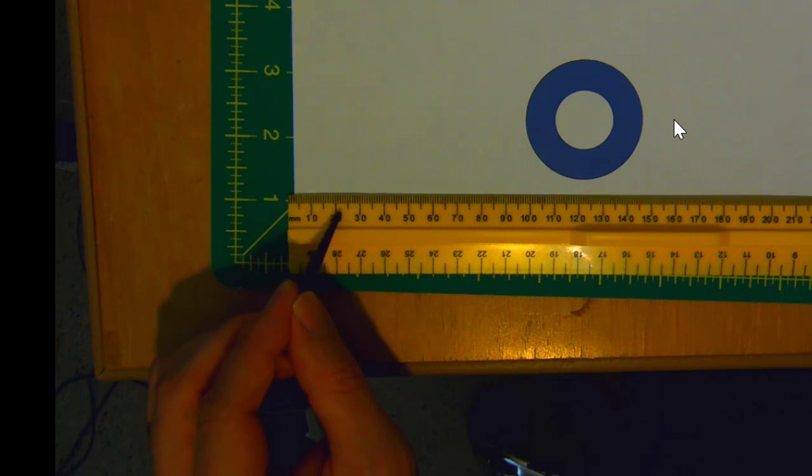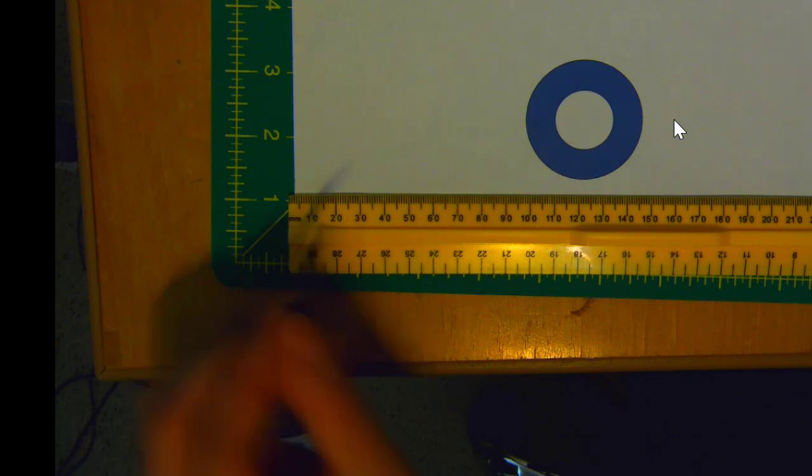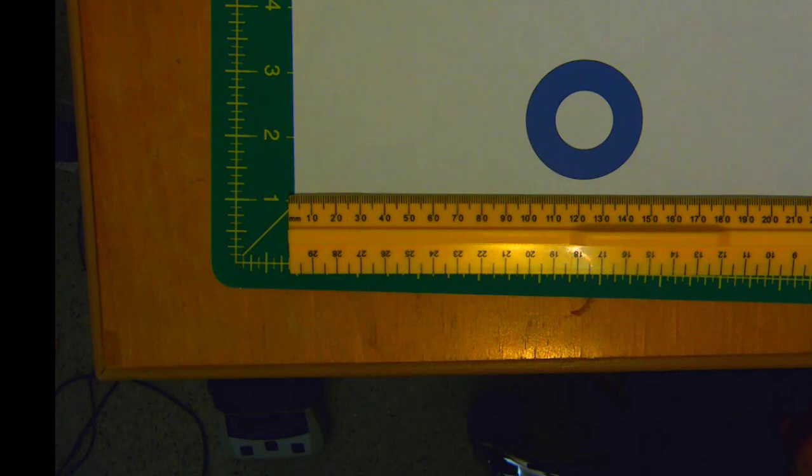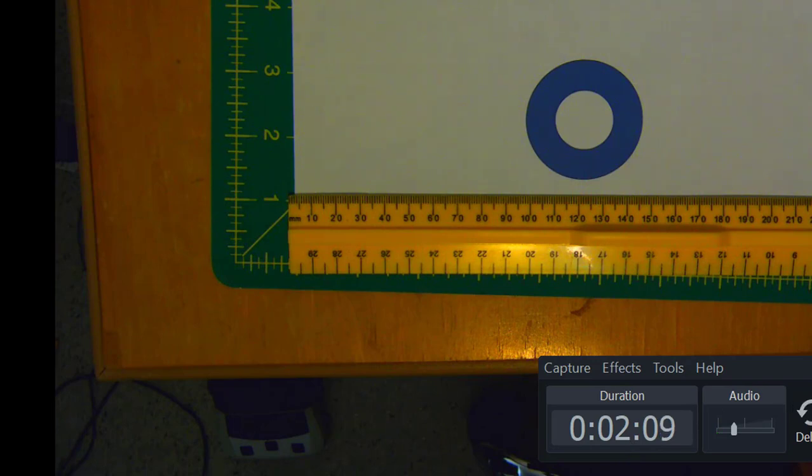We will also be guessing the last digit of the measurement. So on this scale, we have a mark for, say, 1.1, 1.2. So that is not the last digit you'll be guessing. You would be guessing a digit after that. So as we go through and make these measurements, make sure that you are using units of centimeters and that you are guessing the last digit. So the next thing we'll do is get this in place in order to make the measurements.